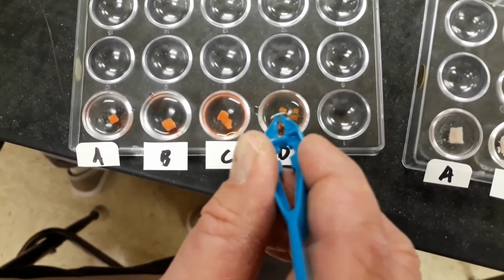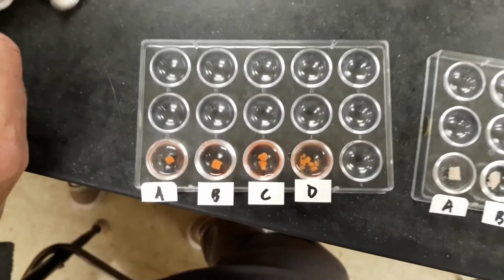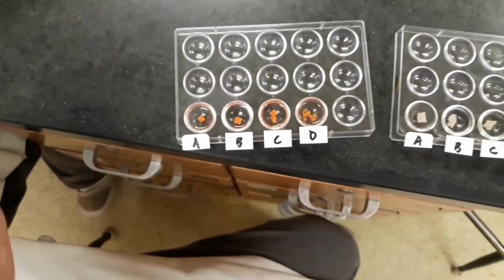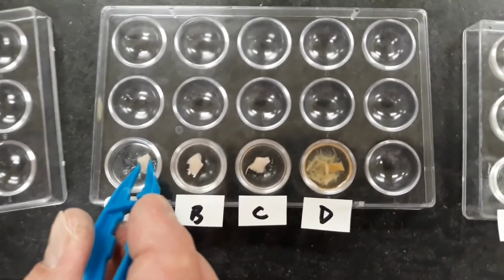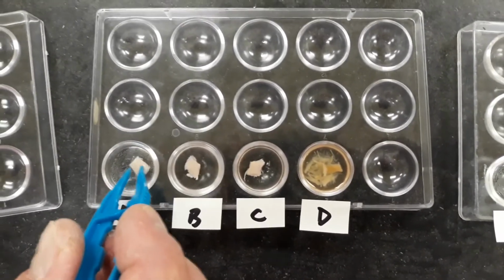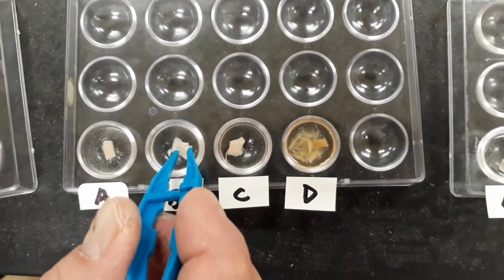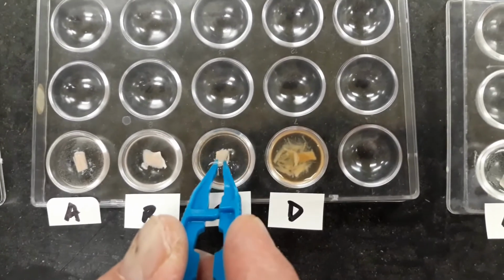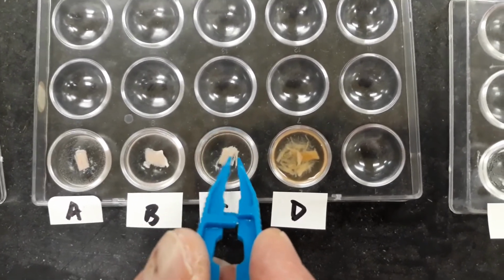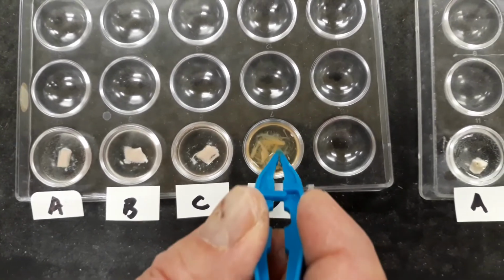I picked it up and just squeezed it, and then it broke into pieces. Then we go to the protein, and this was just a piece of turkey meat. You can see in A, it's starting to decompose a little bit. B, largely intact. C, largely intact, maybe a little decomposition. And D, you can see is pretty much mush.